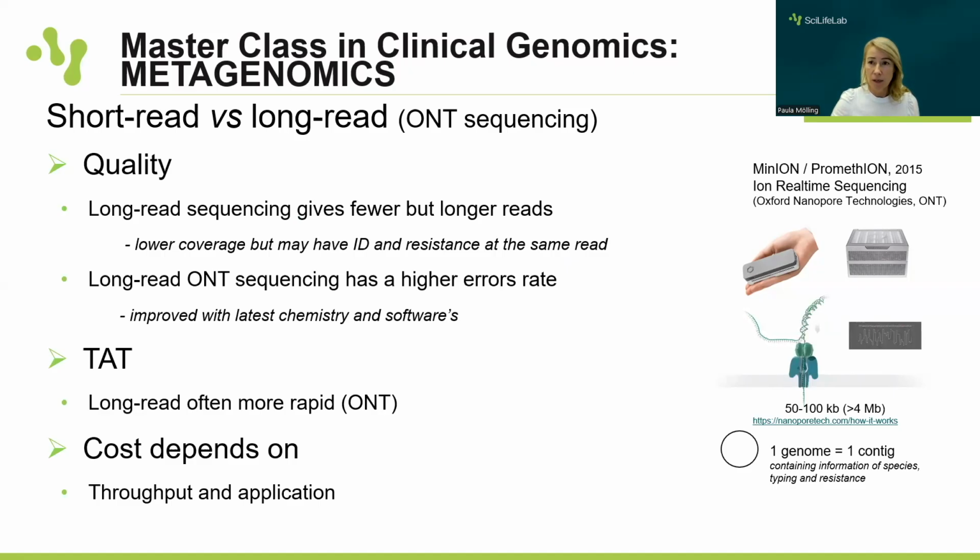But here you can be sure that you use the latest chemistry and software, because the error rate has been improved by that. And the turnaround time: the long read sequencing is often more rapid if you compare to the short read. And the cost between the different technologies often depends on the throughput and application.